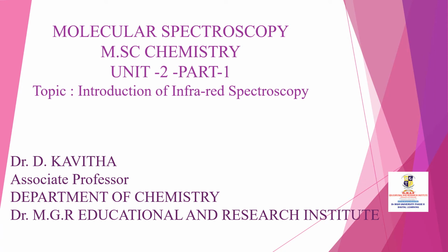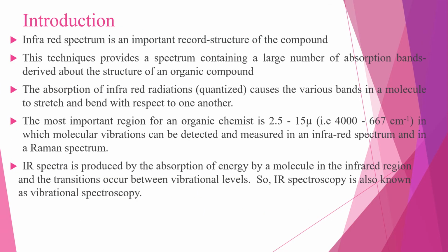Good morning, students. Today we are going to start Unit 2, Infrared Spectroscopy. In this PowerPoint, we are going to see the introduction of IR spectroscopy.